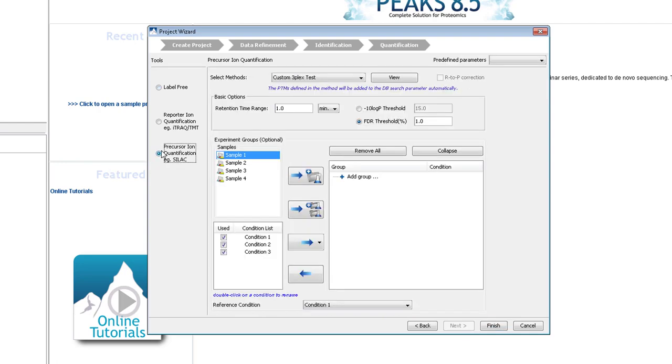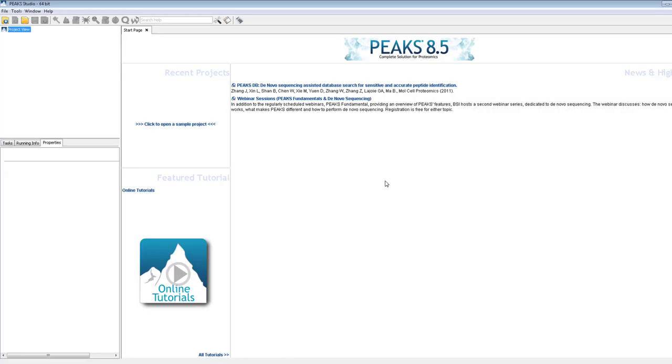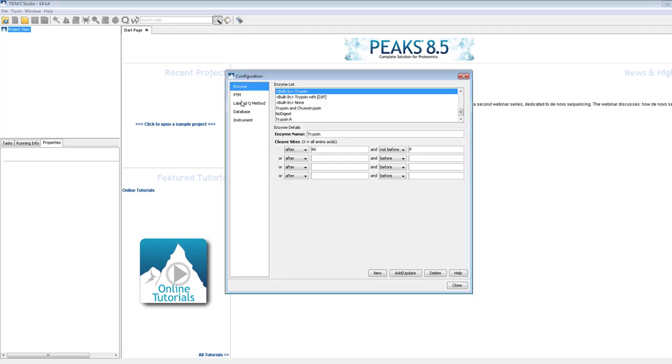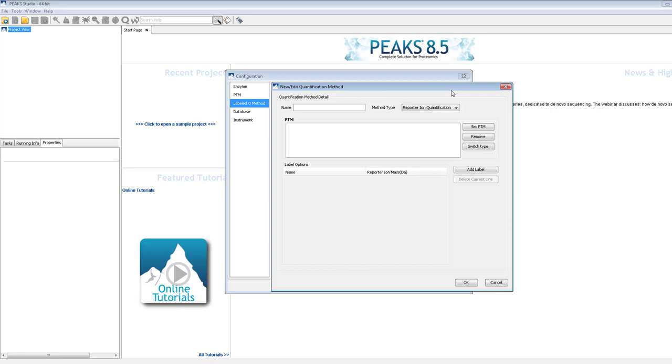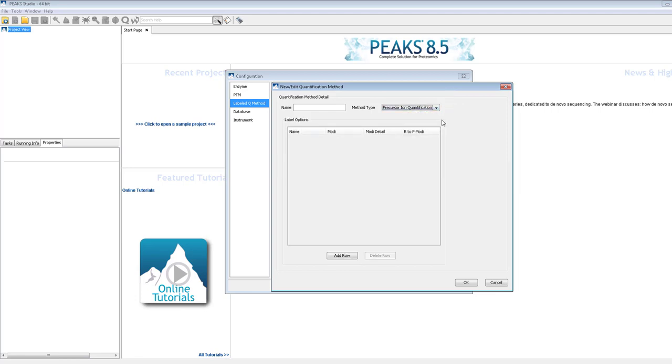In this case, a new method was added. To add a new method, go to Configuration, then Labeled Q Method and click the New button in the top right hand corner. Select Precursor Quantification from the Method Type drop down menu. Then, add rows to add labels.